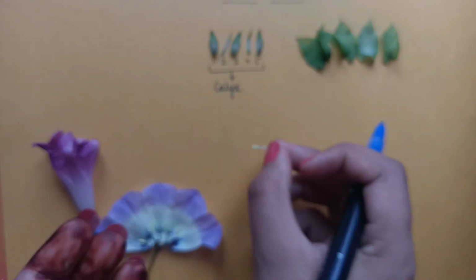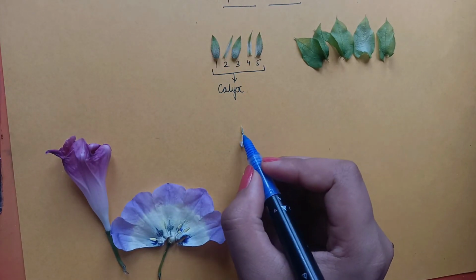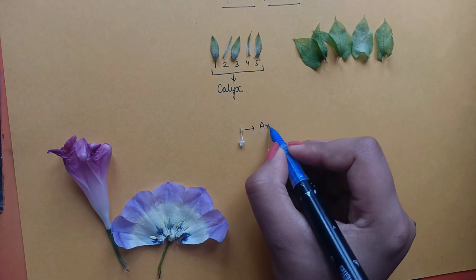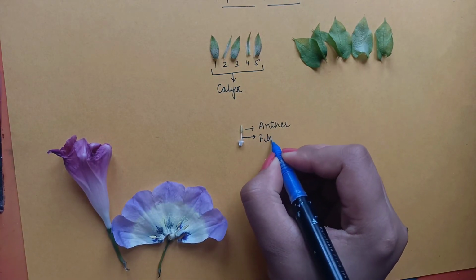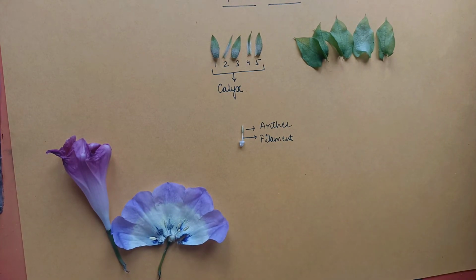Then I showed you the stamen. You can see this is a stamen. I told you about the stamens. You can see over here, I told you that it has a bilobed, head-like structure that is known as your anther. And it has a long, narrow, thread-like structure, that is your filament. I told you this also.